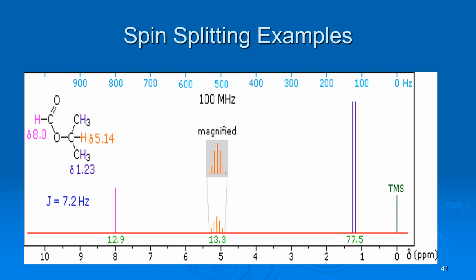All right, here's one more example. So this hydrogen over here is not split by anybody, so it should be a singlet because it's way over here. And we know that when the hydrogen's directly attached to a carbonyl group, it should be way far here. So that's this carbon right here. And it's purple. You can see that they've got the same colors that they've labeled them. So this kind of fuchsia purple at 8 is this hydrogen here.